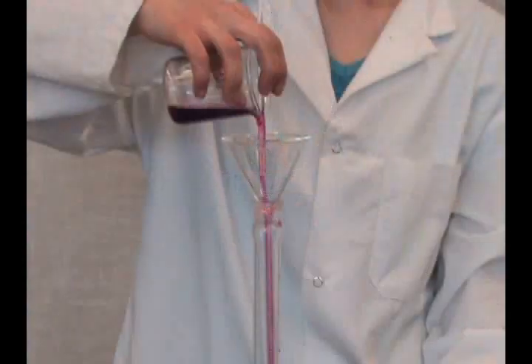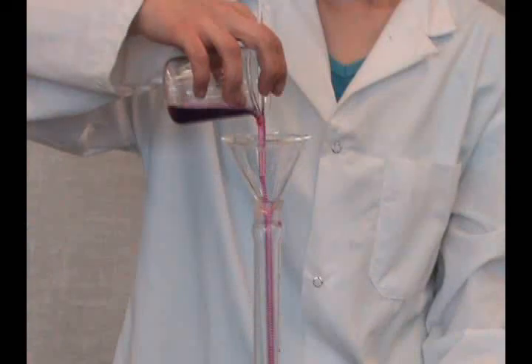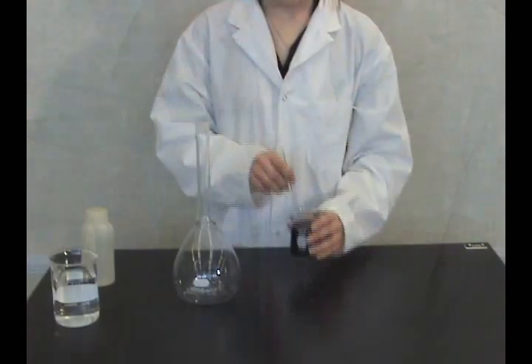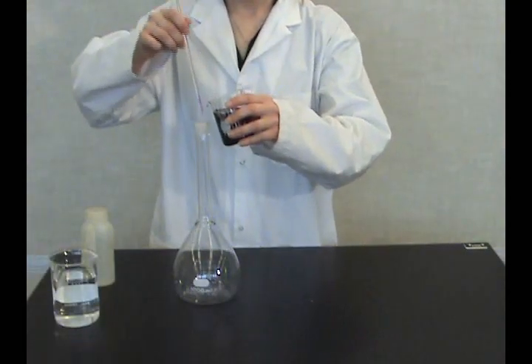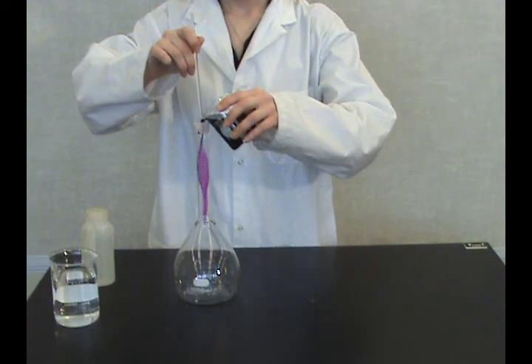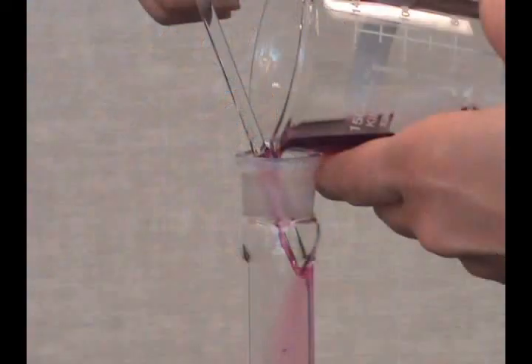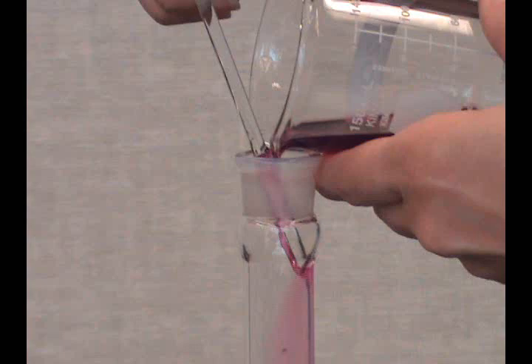Use a funnel to pour the solution into a 1000 milliliter volumetric flask, or if capable, just the glass rod holding it against the spout of the beaker. Make sure the tip of the rod touches the inside of the flask neck to control the flow.